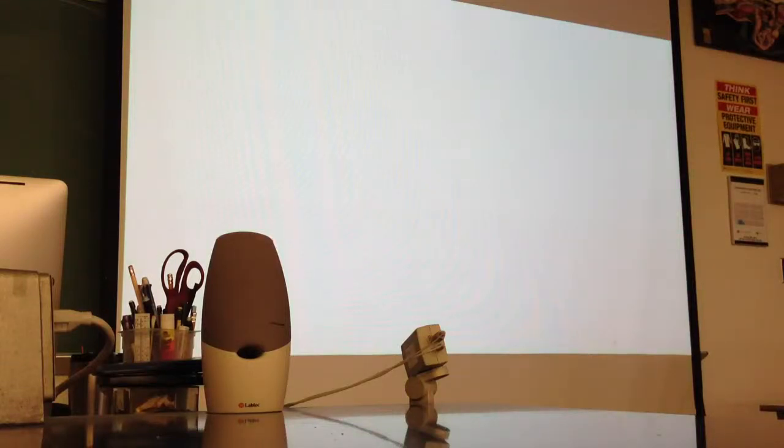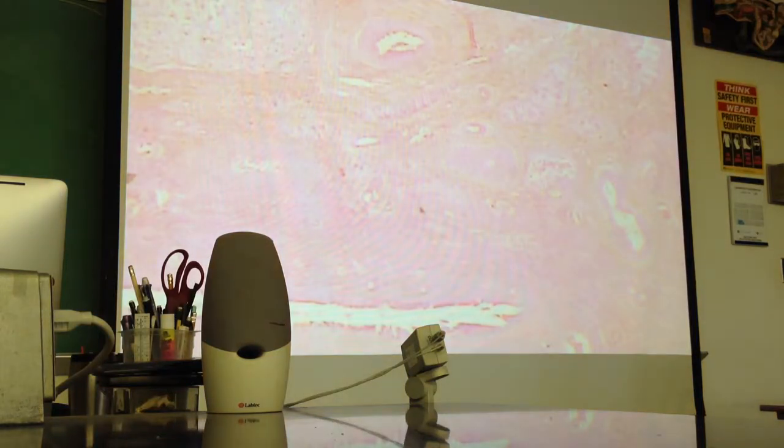There are two different sets that you can snag from. There's a maturing ovary section and a corpus luteum section. With those two, you can pick which one you want, but you're likely only going to find one structure that you need to identify in each one. I got pretty lucky with this one, so we'll see if I can find what I'm looking for.